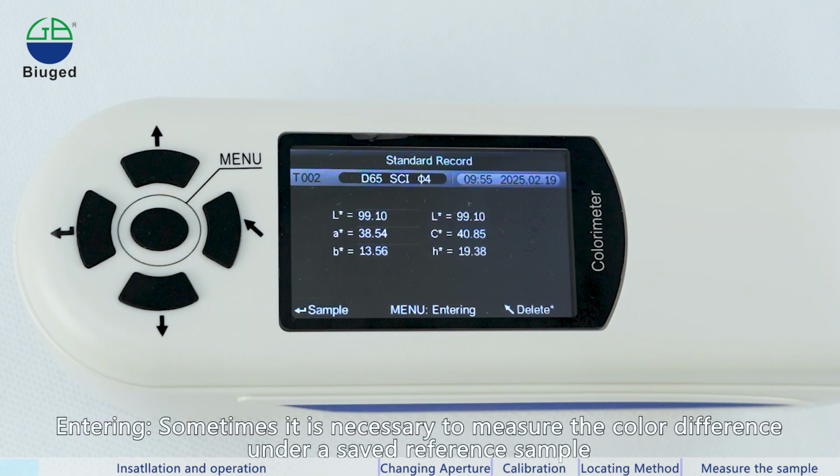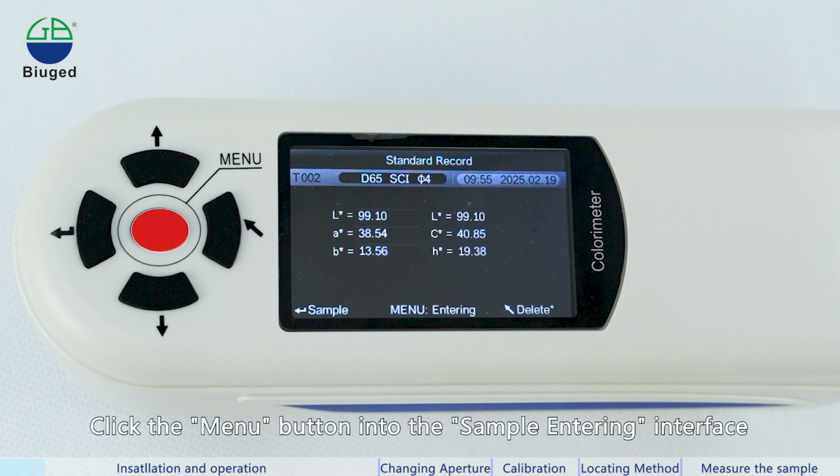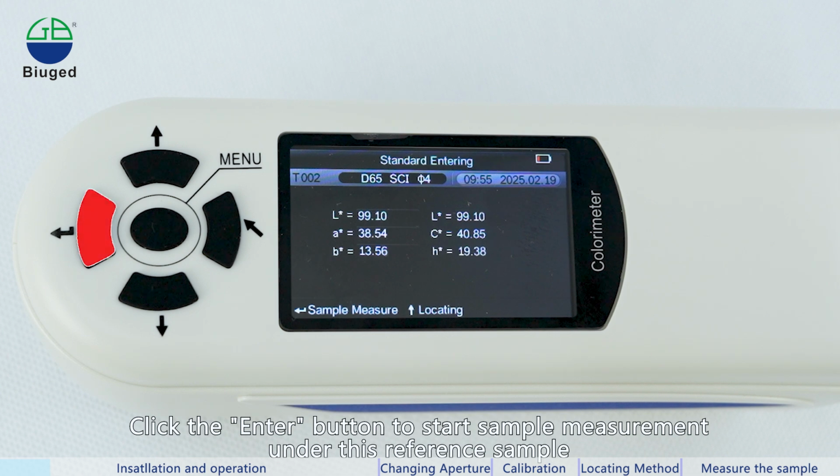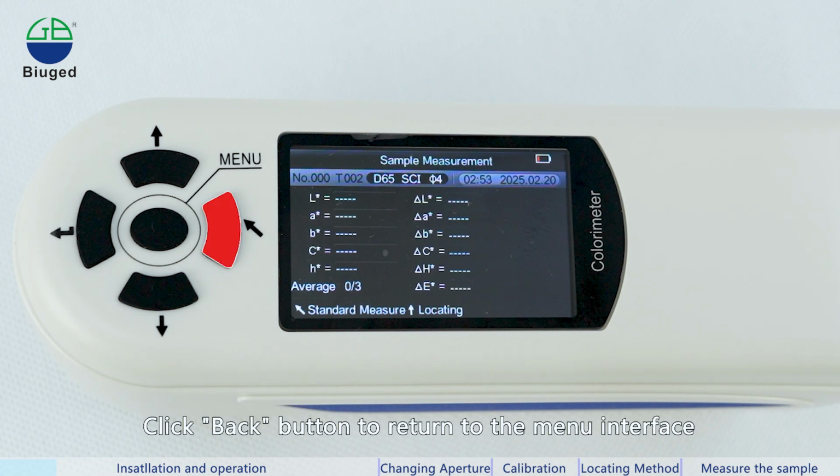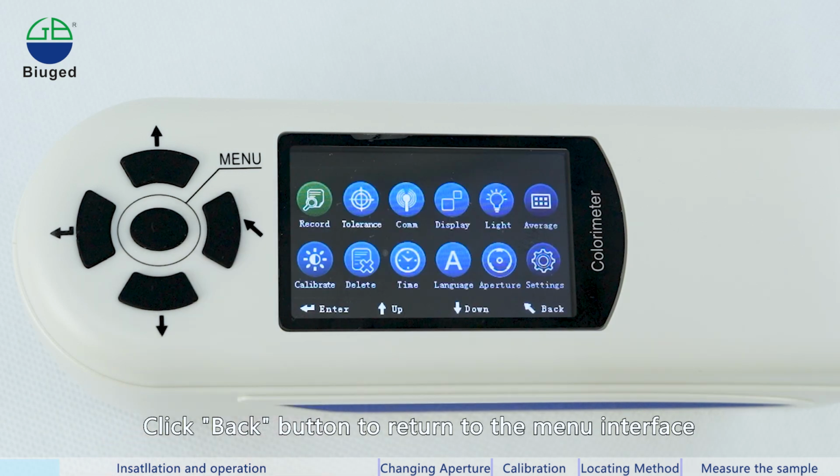Entering. Sometimes it is necessary to measure the color difference under a saved reference sample. Click the menu button to enter the sample entering interface. Click the Enter button to start sample measurement under this reference sample. Click the Back button to return to the menu interface.